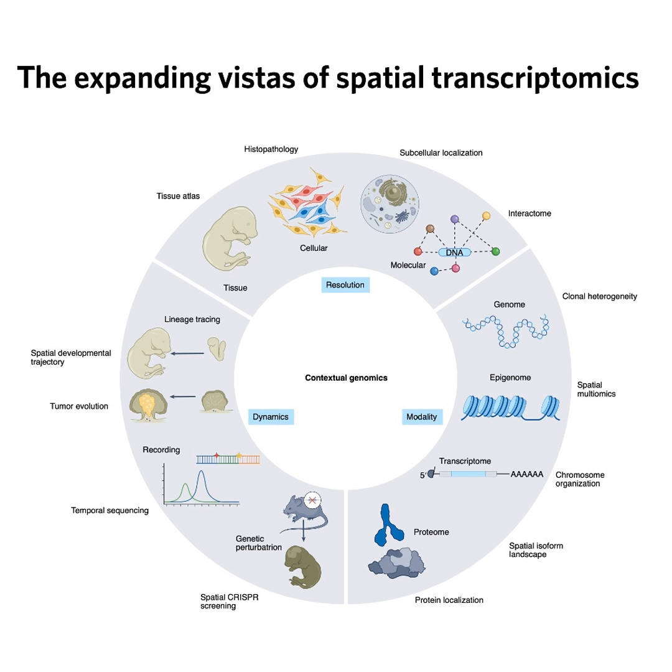Well, I think ST is best suited right now to answering three major classes of questions in tissue biology. And they kind of build on each other, moving from simple cataloging up to dynamic signaling. Okay, let's take the first one. Just the basic sense is figuring out who is actually present in the tissue. Right. That's cell type composition. ST lets us map out which specific cell types are present and, crucially, how they are spatially distributed across that tissue section. Where are they located?